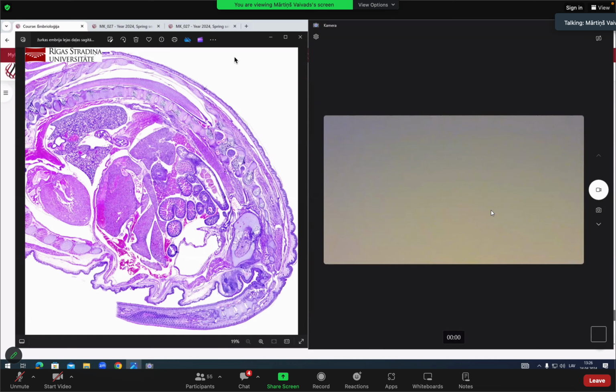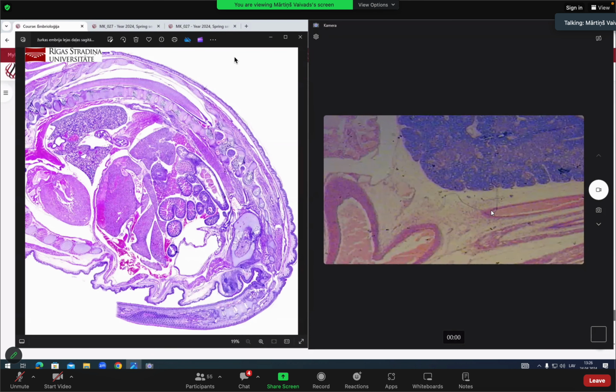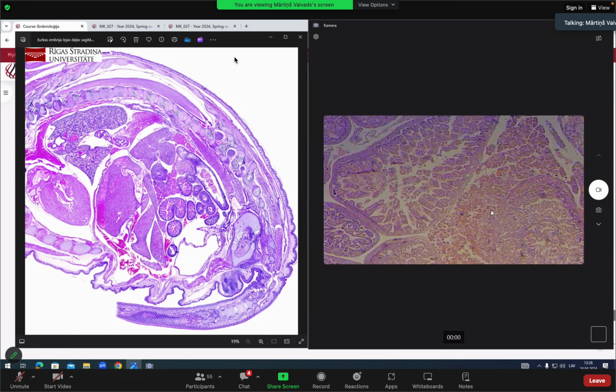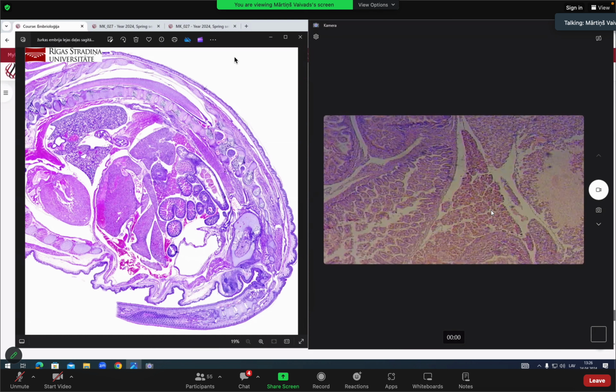Pancreas 25A. Just wait a moment. There are sometimes some limitations to the slide. No, okay, I will show you the rat slide then. This is the rat sagittal section. This is a massive slide, but I will point at the area where the pancreas is visible. At first glance, it's very tricky, but it's actually not that bad.